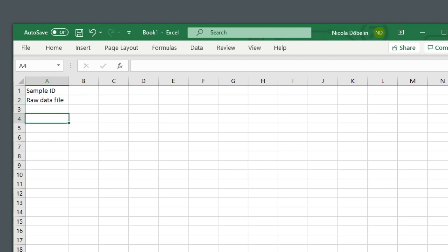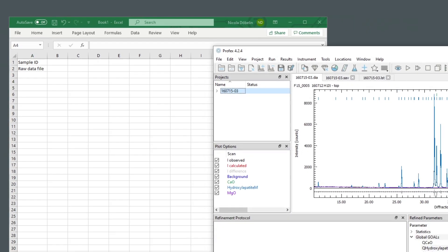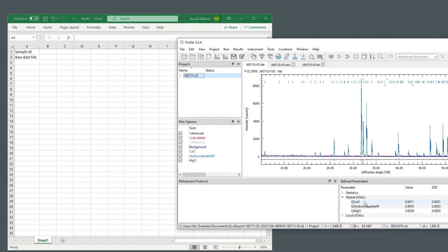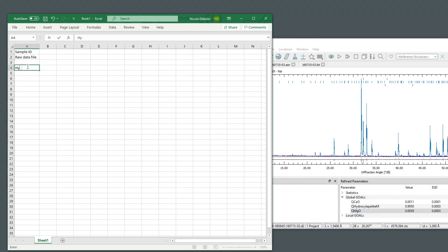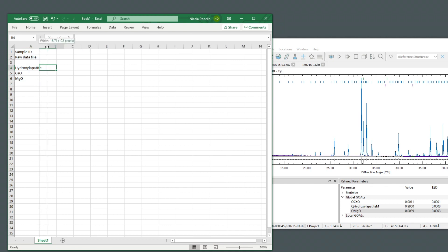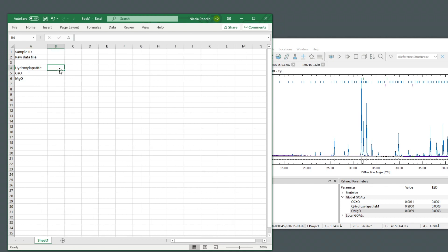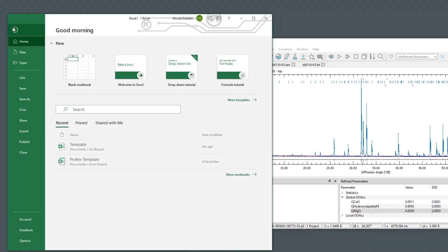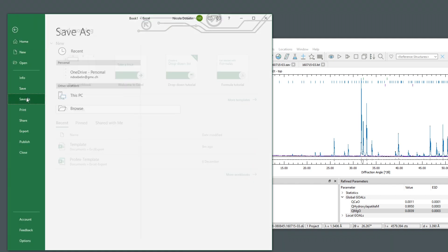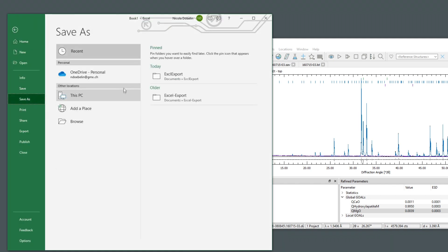And then we have some refinement results, for example, the quantity of hydroxyapatite, calcium oxide, and magnesium oxide. And we want to write the quantities to the cells B4, 5, and 6. Now we save this empty template with a new name.